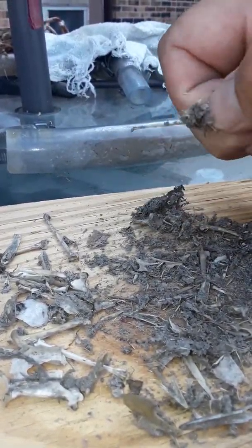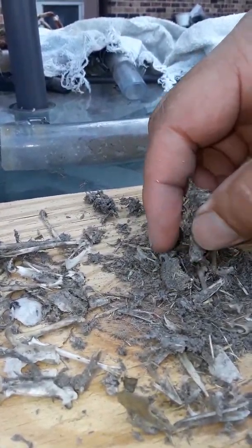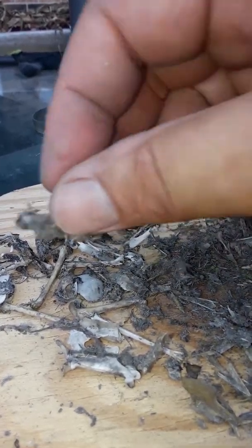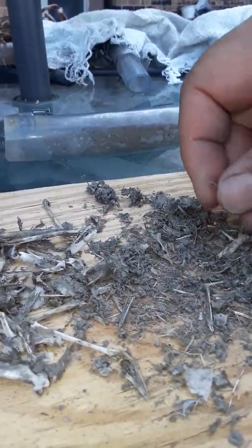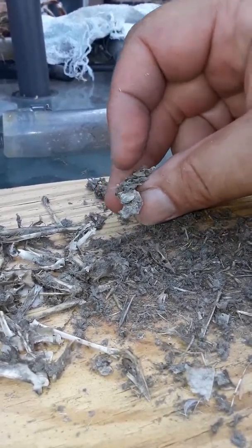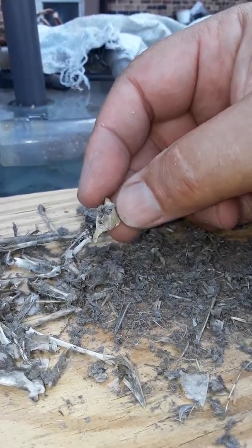Usually when there's rodents you find their teeth and their skulls. But look at these long bones — it's a bigger bird but it's a dainty bird. There's the other foot and leg, so I'm thinking just one. That's part of the wing there, I'm pretty sure. I wish I knew what species this guy was consuming. Yeah, these are the remains of one bird.